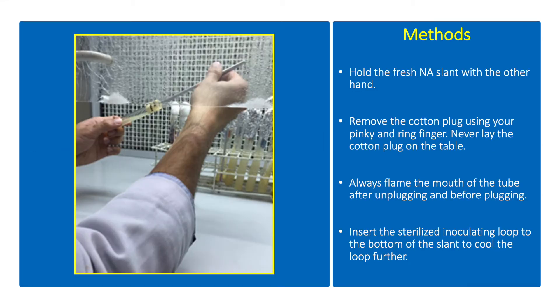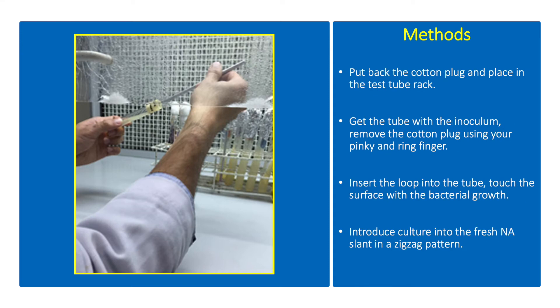Hold the fresh NA slant with the other hand. Remove the cotton plug using your pinky and ring finger. Never lay the cotton plug on the table. Always flame the mouth of the tube after unplugging and before plugging. Insert the sterilized inoculating loop to the bottom of the slant to cool the loop further. Return the cotton plug and place in the test tube rack. Get the tube with the inoculum.